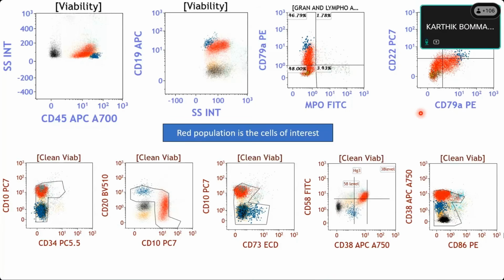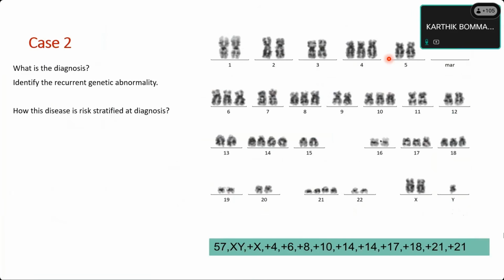In this case, a 6-year-old child having acute manifestation and having blasts, and we are having B lineage markers. ALL. Yes, which ALL now? T-ALL? No, sir. B cell, it's a B cell ALL. Okay, got it? Because we are having B cell markers. So the diagnosis is B-ALL.